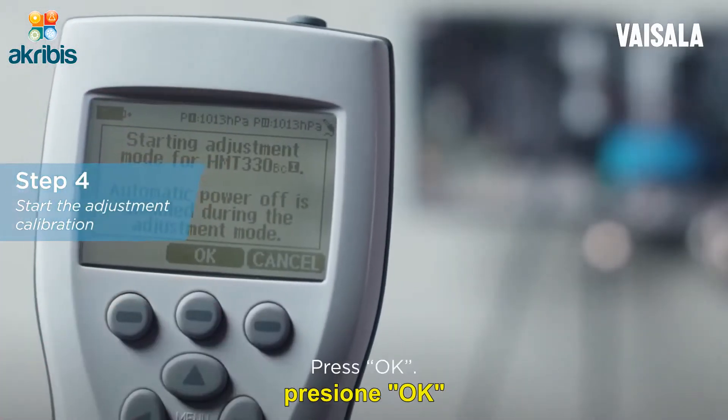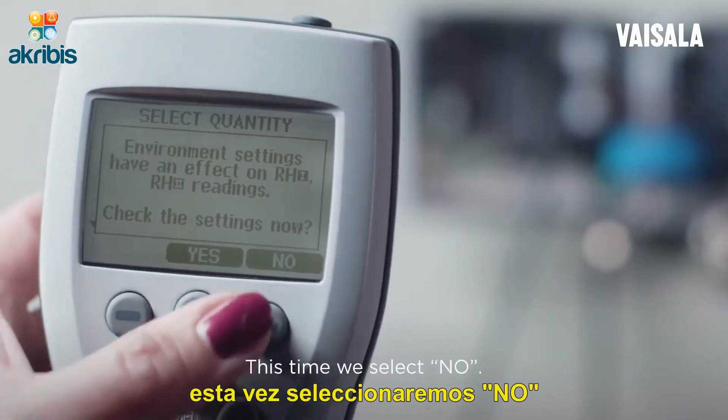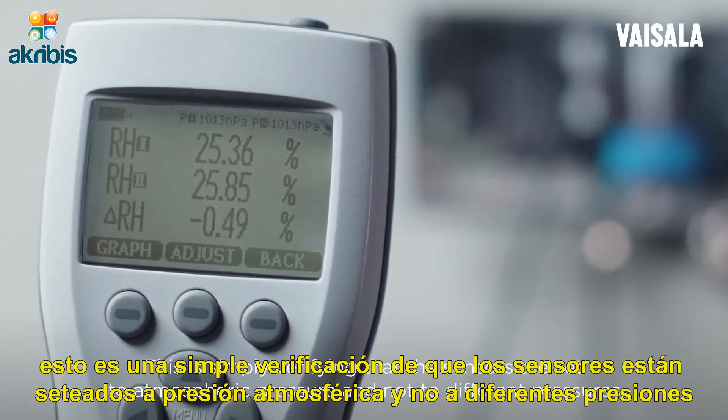Press OK. Now select RH. This time we select No — this is simply verifying that the sensors are set to atmospheric pressure and not to different pressures.